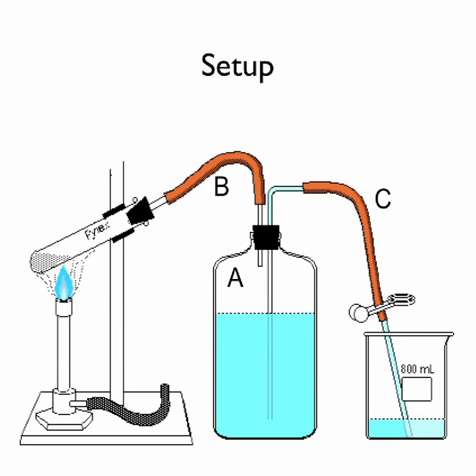At this point, make sure that the pinch clamp on tube C is open before you start heating the potassium chlorate mixture. Things to remember while you're heating your sample. Start by using a soft blue flame. Hold the burner to control the rate of heating. Heat it from top down to prevent escaping oxygen being blown out of the reaction mixture. Make sure you do not heat and burn the clamps on the apparatus or melt the rubber stopper. Control the rate of heating so that the molten reaction mixture does not rise above the bottom third of the tube. Also, look at the water flow coming out into the beaker.